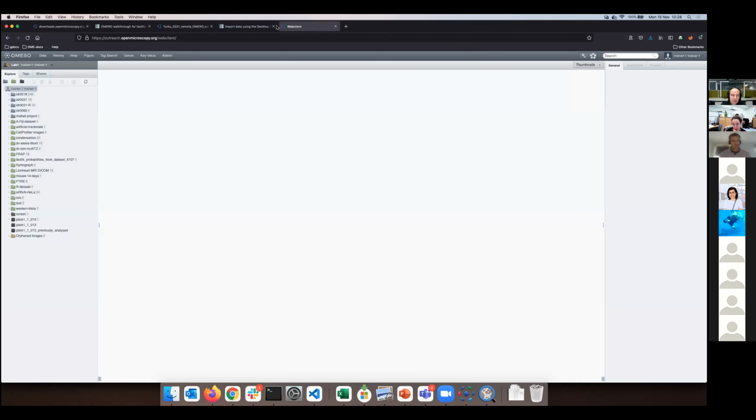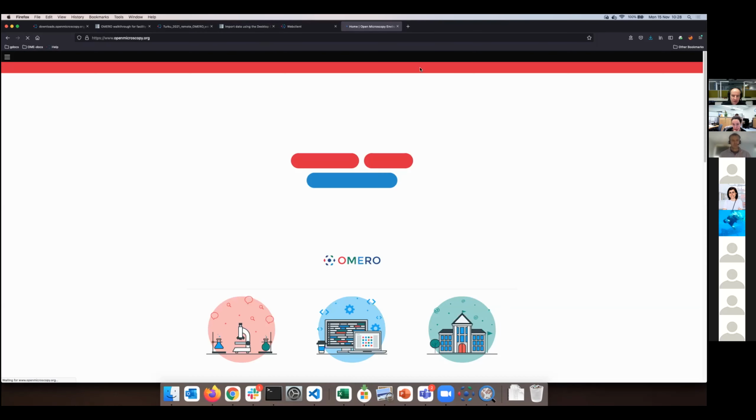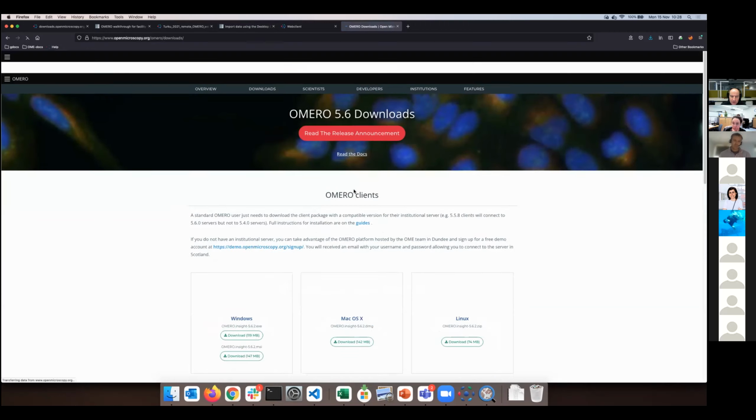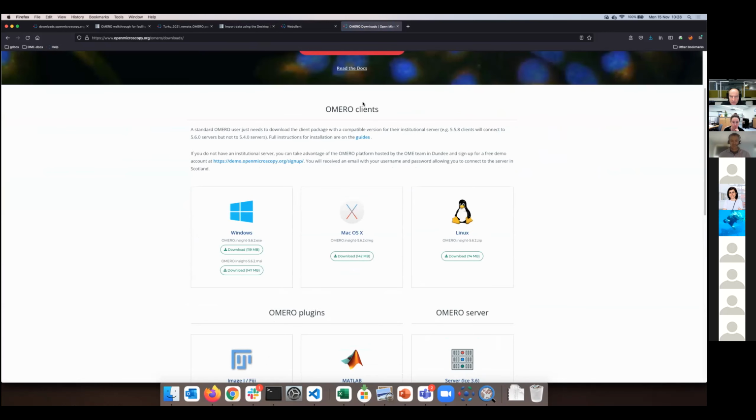Basically, you go to the Open Microscopy website. Then you go Products, Omero, and you click on Download version, whatever there is. It's 5.6 at the moment, and then you scroll down. Now the confusing part is only this one. It says Omero Clients. You remember the word client? This actually means Omero Insight. Okay, and the Omero Insight is in those three boxes. Obviously, you will choose very often Windows because you're sitting on a Windows machine, or Mac or Linux, depending on your local operating system, and then you click on this button and the download will start.